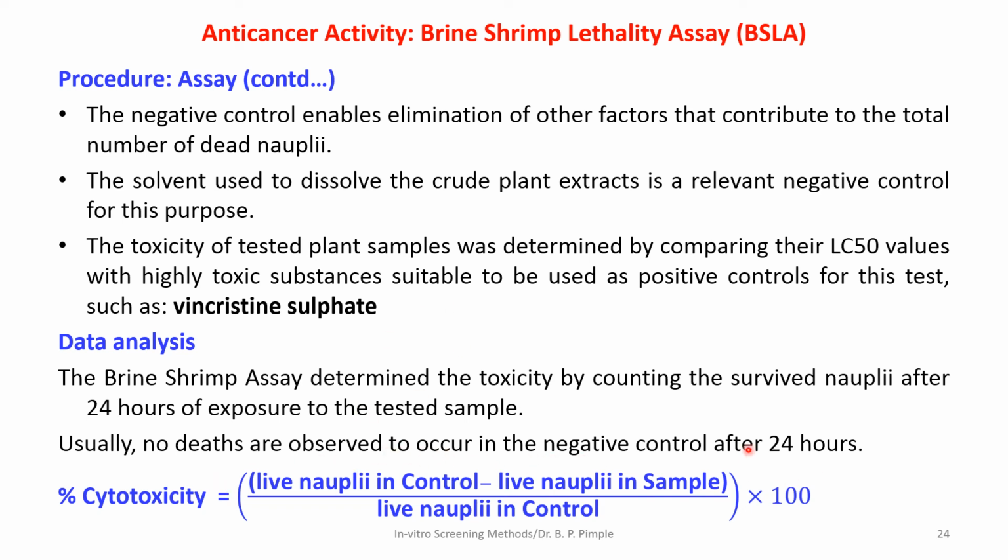So again, by applying a similar formula, you can determine the percent cytotoxicity of the compound. And again, a standard can also be implemented as a separate set in this protocol.